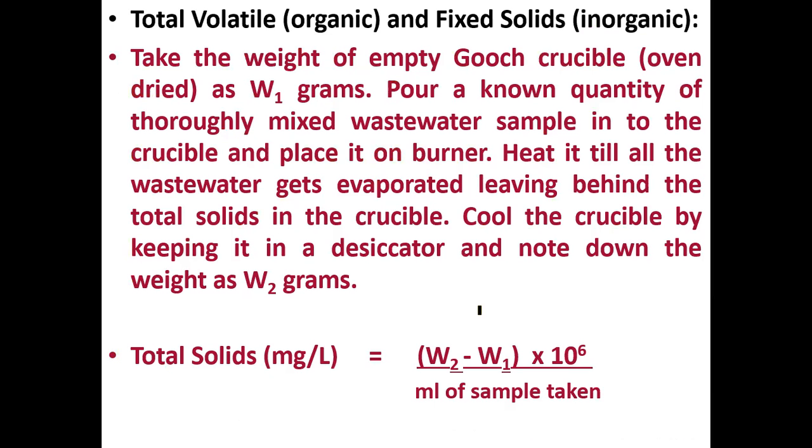Then there is something called total volatile, organic, and fixed solids. Total volatile solids are called organic solids, and fixed solids are called inorganic solids. So what are you supposed to do when finding this out? Now, this is for your additional information. You might not do this in lab.